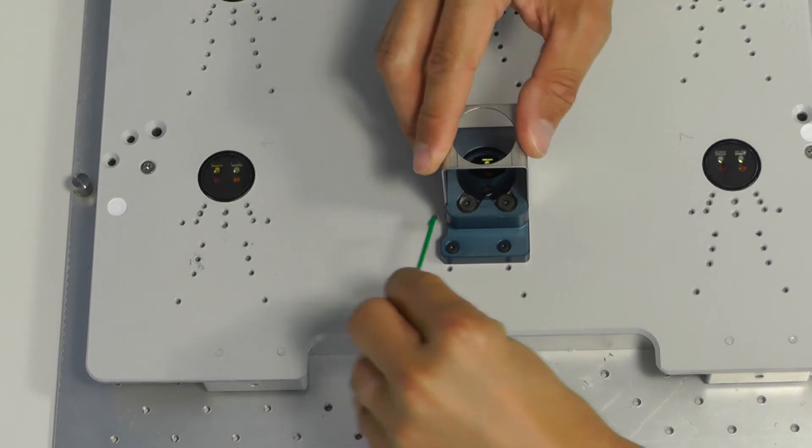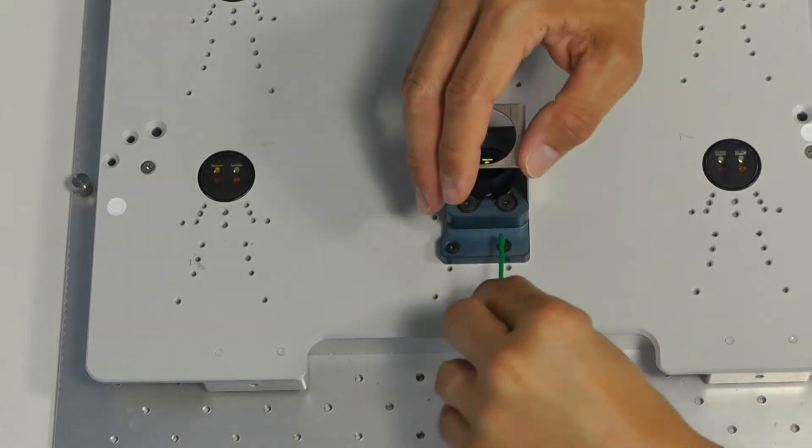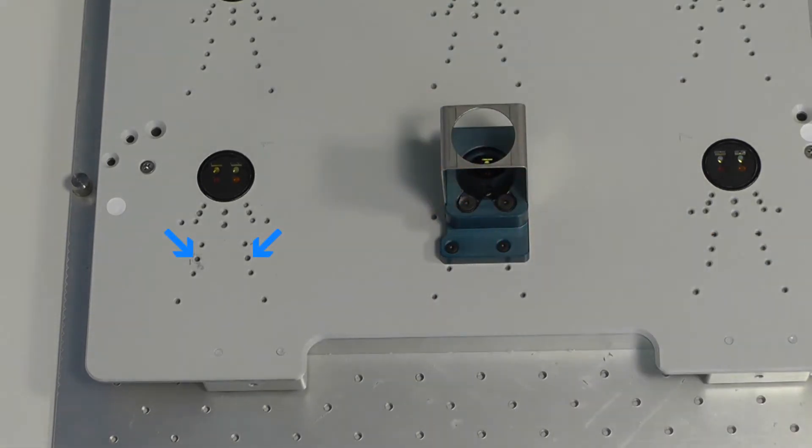Attach the adapter with the two screws using a hex key. Make sure you choose the right holes on the SFR main unit, so the adapter is positioned correctly. And that's it.